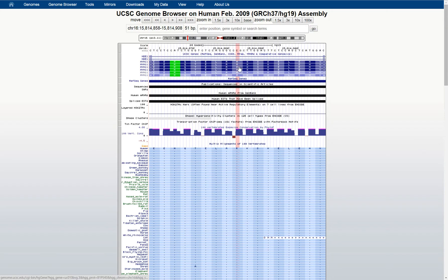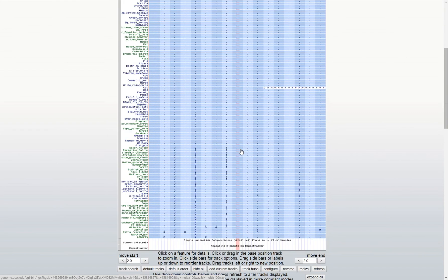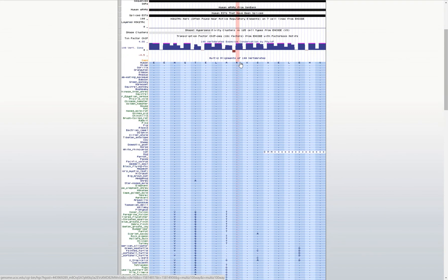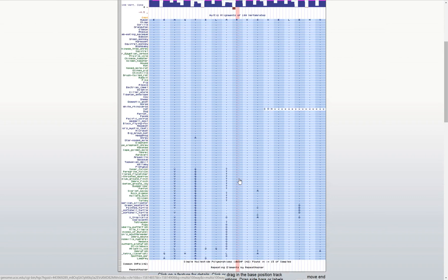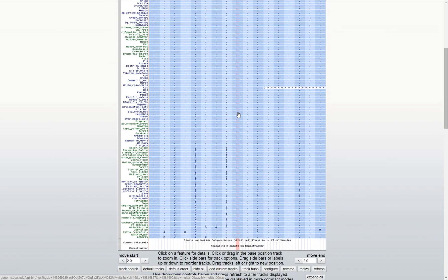You can see here what the wild type is, and this appears to be conserved across all the species — all of them have that same amino acid in that location — which again suggests that it's an important amino acid residue.